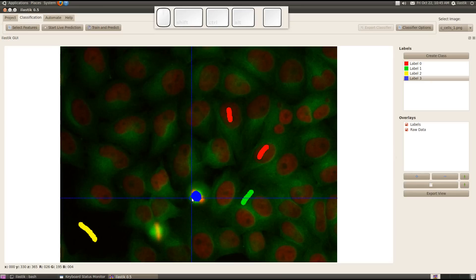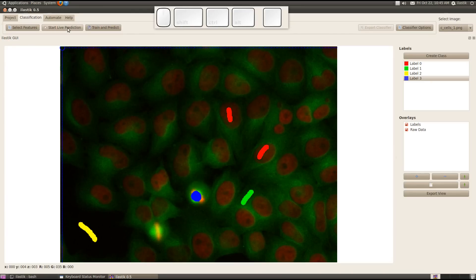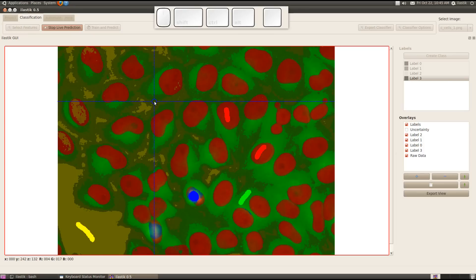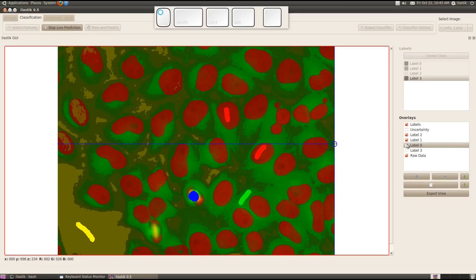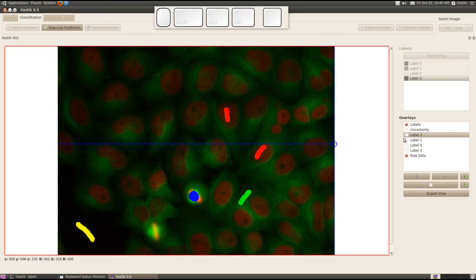Now we can start the interactive part by switching to the live prediction mode. I click here and Elastic computes a prediction based on the user input. As you see on the upper left, there are still some errors. When I disable those overlays on the right side, you can see there is inhomogeneous lighting in this image.